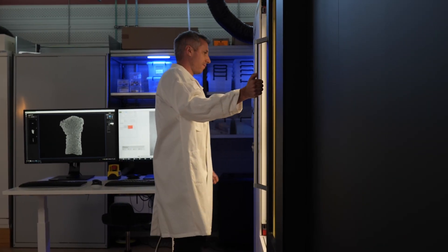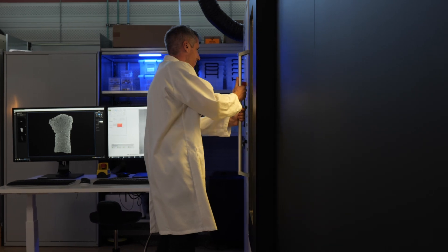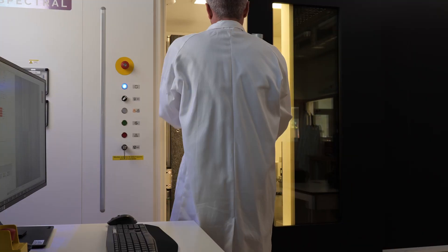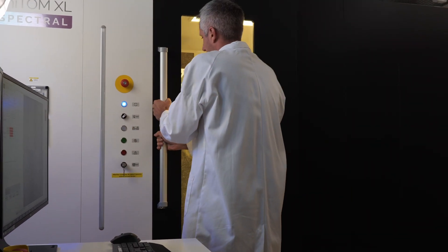So we are very excited to have now this spectral CT available in the lab because it allows us to combine chemical information from the objects that we study with the classical structural information that we can get from a normal X-ray CT scan.